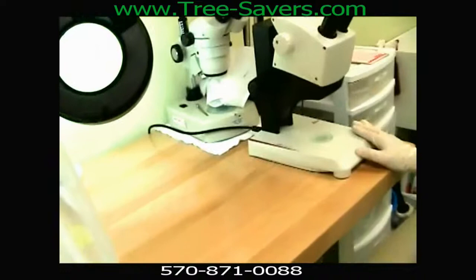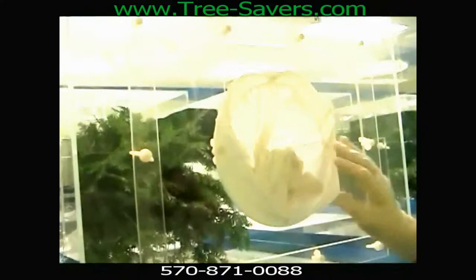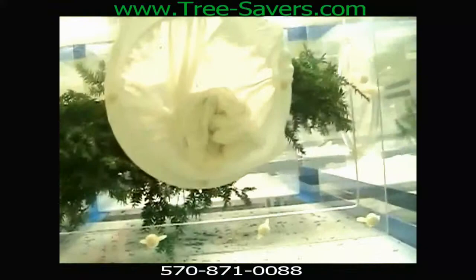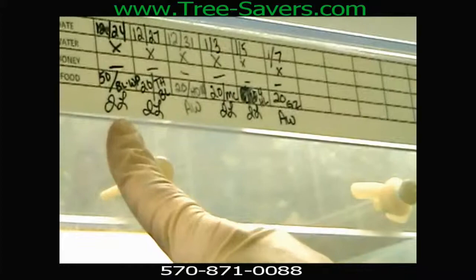I'm going to show you one of those rearing boxes and then we're done for today. Here's one of our rearing cages — I'll allow Amanda to pan around. This is our feeding chart every day. In the beginning they get 50 twigs of hemlock woolly adelgid branches. We distinguish what kind of food they got, where it was from, and who did the actual feeding so that we can keep track and minimize any kind of error.